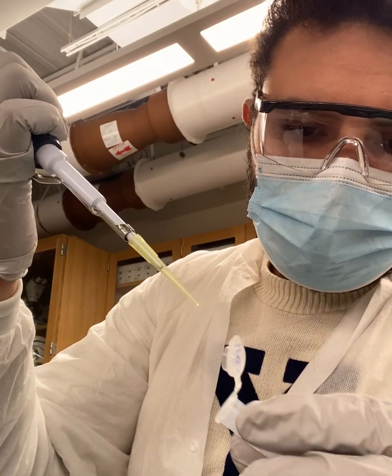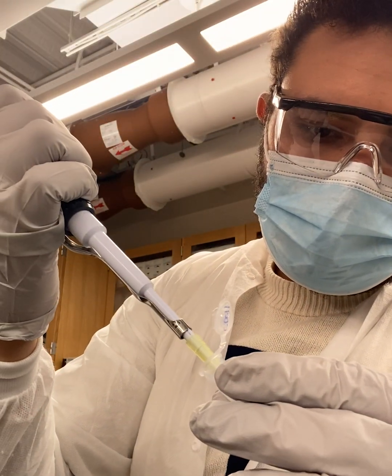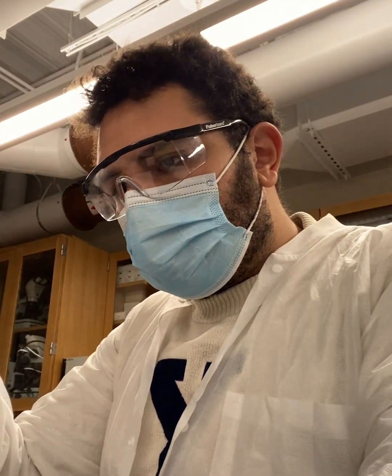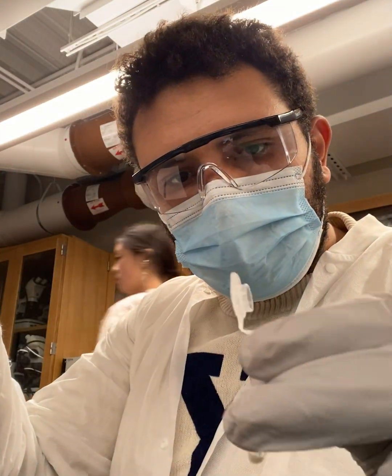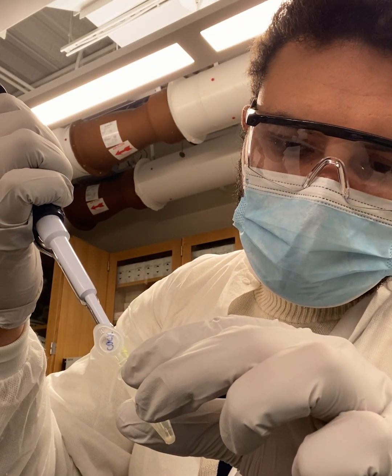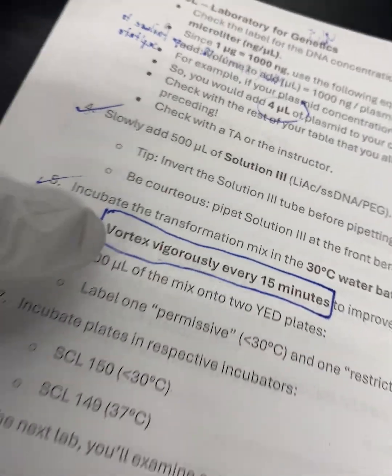Lithium acetate neutralizes the negative charge on the DNA and membrane, while single-stranded carrier salmon sperm DNA protects the plasmid and acts as a carrier. PEG brings the DNA close to the cell surface and promotes uptake. After adding the plasmid, we slowly add 500 microliters of solution 3 and vortex vigorously to mix.